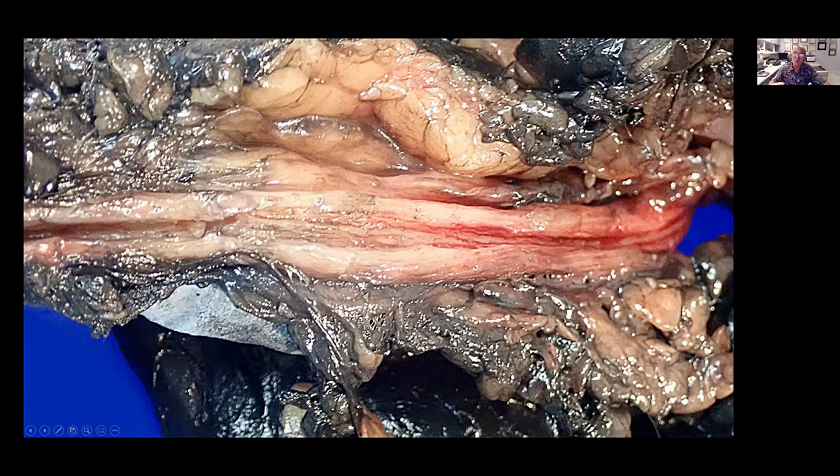And in these cases that I mentioned, 3 or 4 cases, there is a very good description of the kidney, and the ureter is only sampled at the margin, and there is almost no description of the whole ureter. The ureter has to be dissected longitudinally to be able to explore the whole surface. In all those cases, there was either a tumor or a narrowing of the ureter because of vascular malformation, etc., that had been conditioning these procedures.